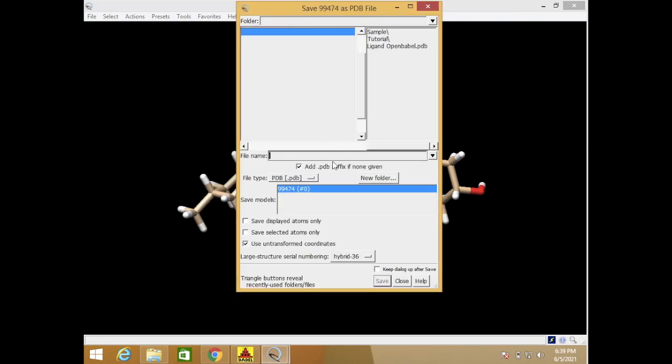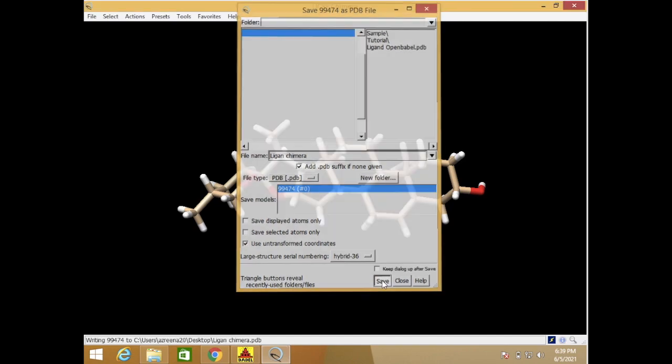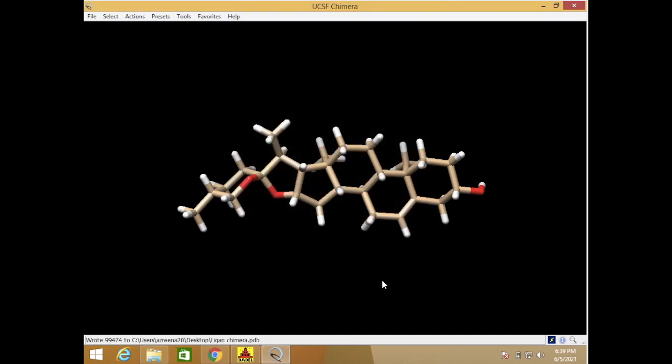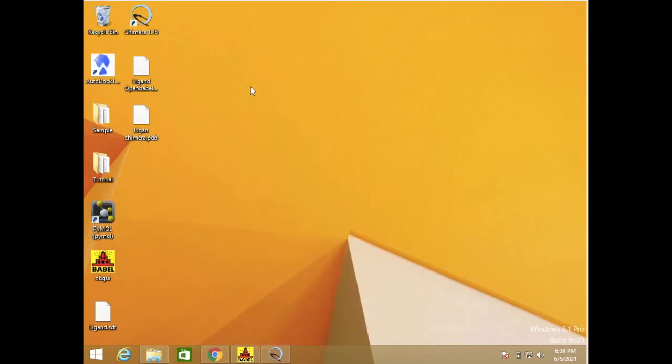So I just name it as ligand. This is our ligand in PDB file in Chimera.